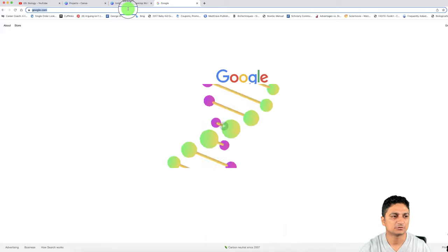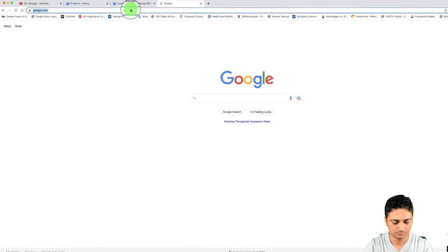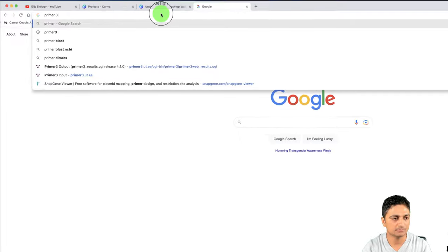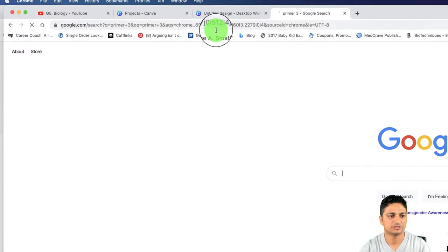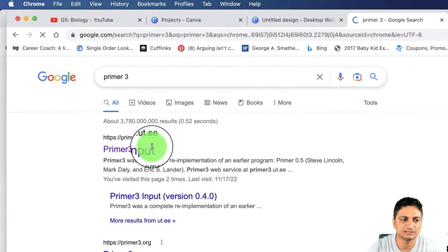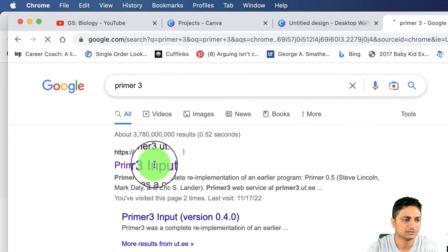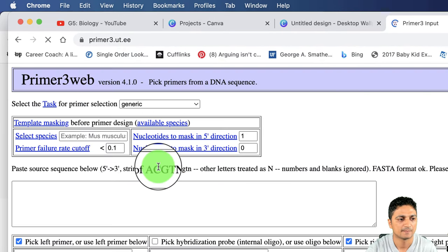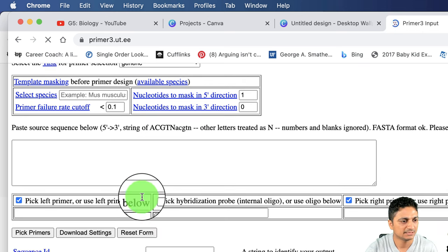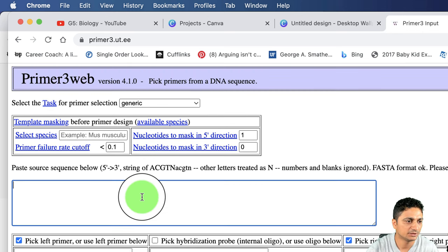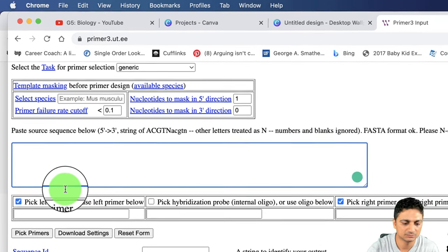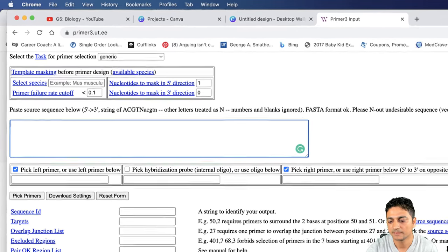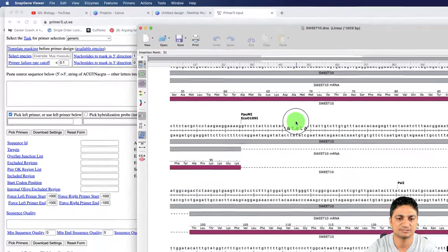Let's open primer3 in online browser. We can use this one for designing the primer and this is free to use. Let's open the first link. This is the place where we can paste our DNA sequences. Let's pull the DNA sequence from SnapGene viewer.